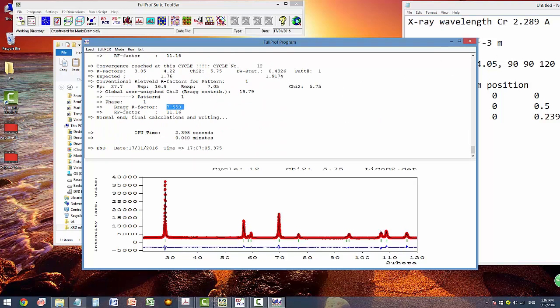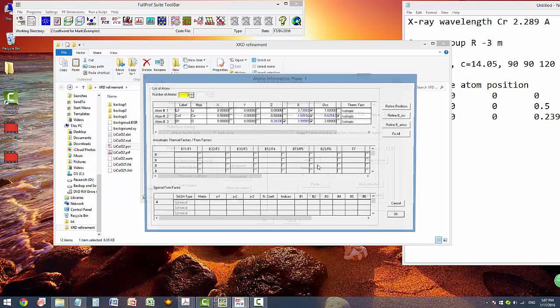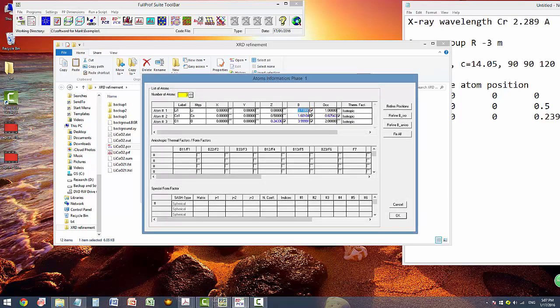Actually, it's even worse. Therefore, I don't recommend you to accept that. But let's see what change has been made. You can see these two numbers are still within a reasonable range, but this number is unreasonable right now.